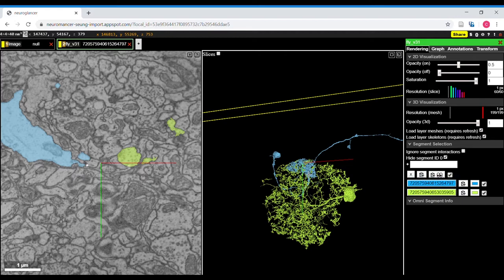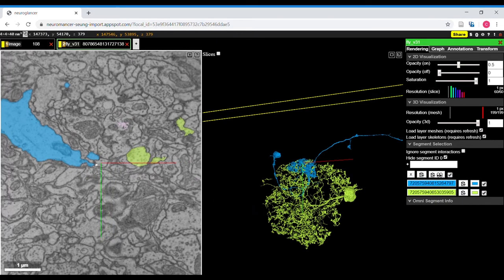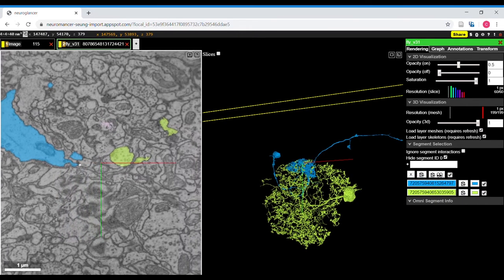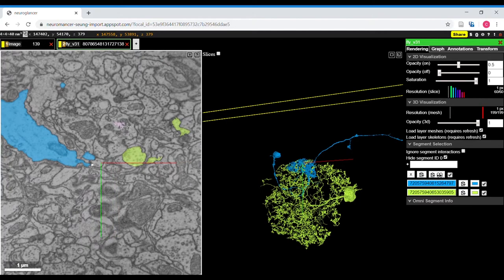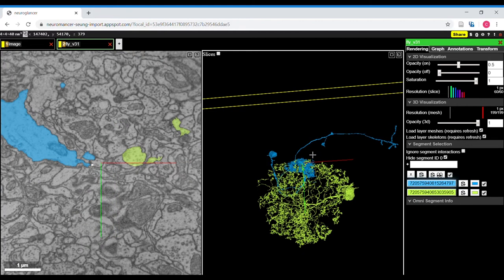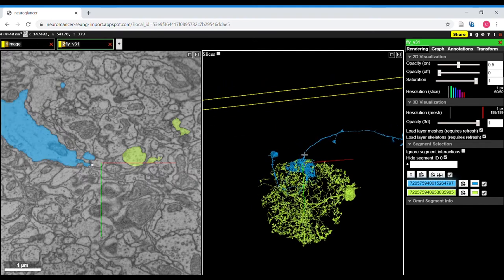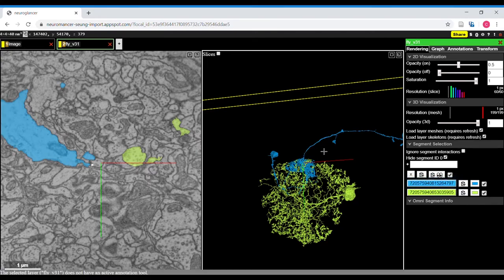If you click and drag in the EM view this pans. If you click and drag in the 3D view this rotates. If you shift drag in the 3D view this will pan.